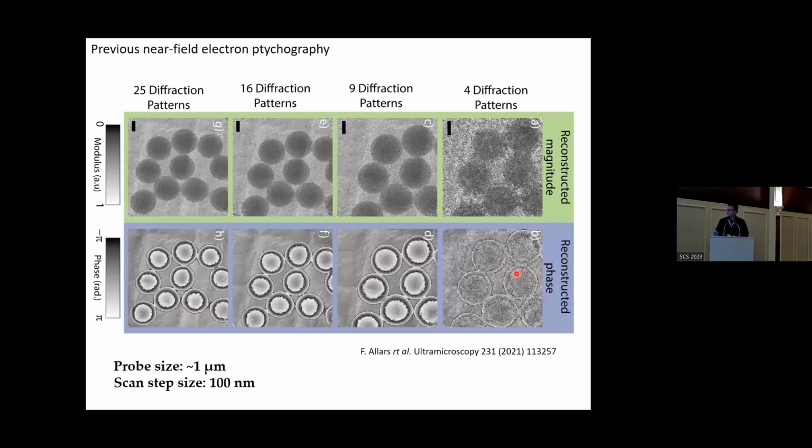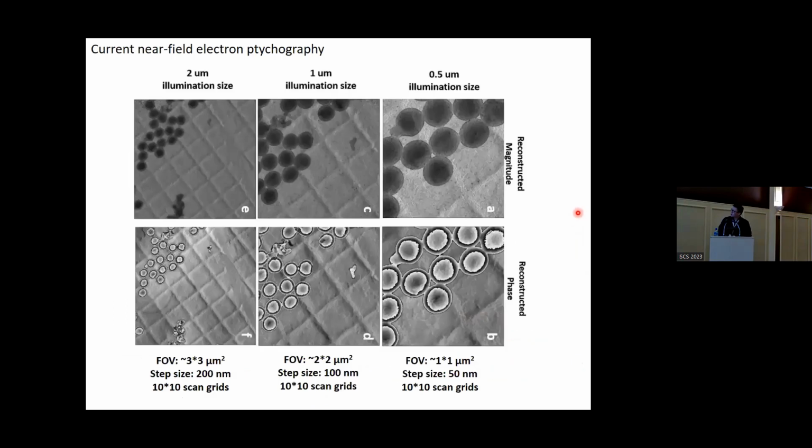Right. So for this one, the resolution is around 3.4 nanometers. And for the other result, the resolution changes with the variable illumination size. At best, we can still get around 3.1 nanometers, and at worst, which is 2 micron illumination size, around 8 or 9.